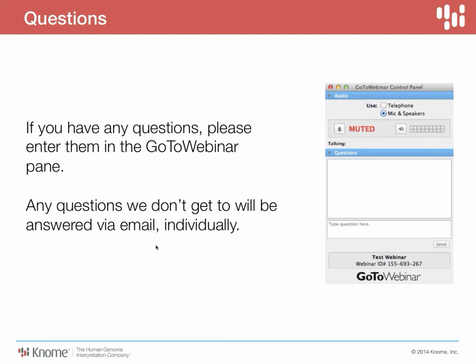The beauty of being able to do that, of course, is that the data are right there. When they come out of that software, they're available to be picked up in our UI and run through the analysis. Meanwhile, we also have in development the user interface extension that will manage that process, and the different aligners and callers can be added in a modular fashion. Okay, thank you so much.